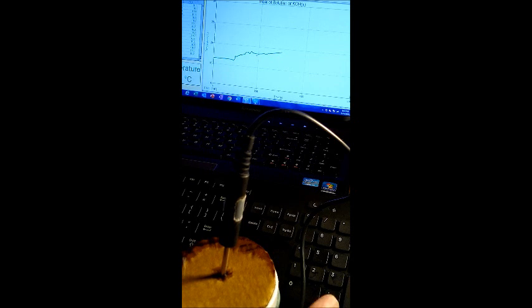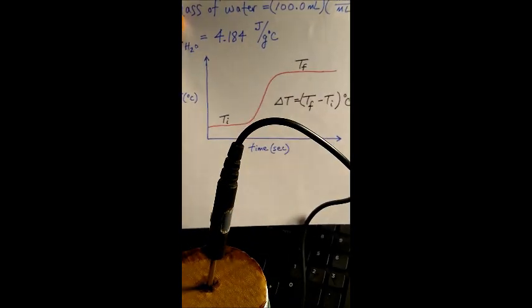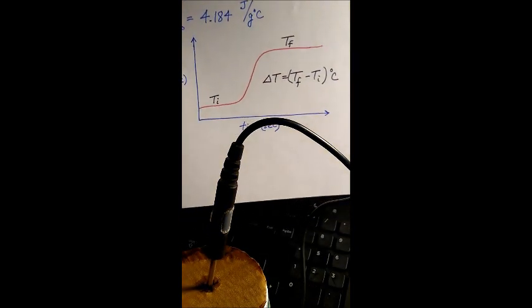Okay, it's still rising. It's going up even more now. I know about what it should rise to, so now it's actually looking better, even though this curve, as you can see, is real jagged. In theory, in a perfect world, if I perfected this, if you were running with better equipment, you would see the graph look like this, a nice smooth rise. And eventually, if I ran this enough times, I would probably get it to do that.